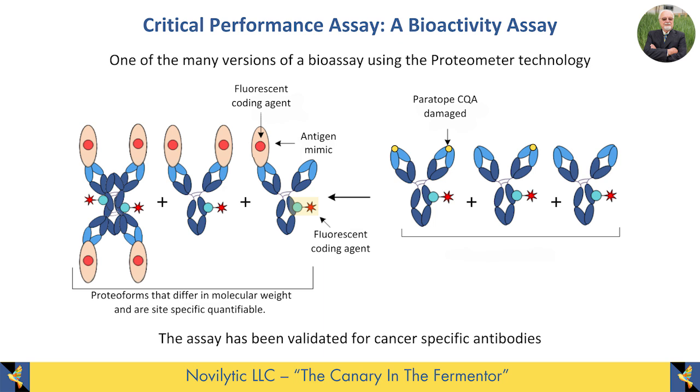And we see it's the fluorescence of this, so we know that it bound to the antibody. And remember, we can do yet another thing. We can separate these molecules. And because this has size, now what we see is that this molecule, which will bind 2 of these, is over here. This one, which will bind 1, is here. And you can differentiate between all of these forms.